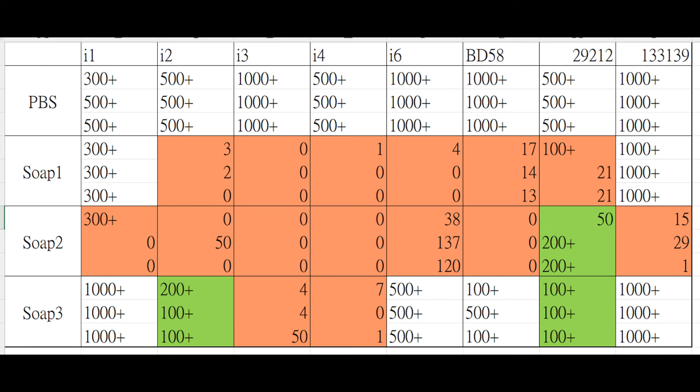You might feel that this number two soap has the best antibacterial effect, but when you come to this one, this bacteria 29212, it is the number one soap that has the best antibacterial effect on this bacteria.